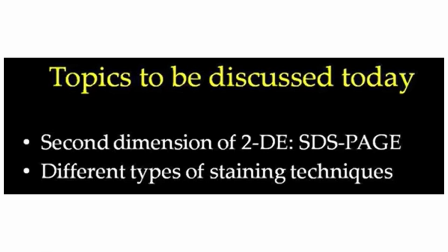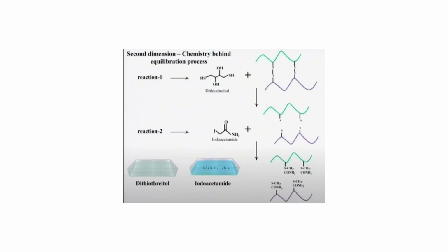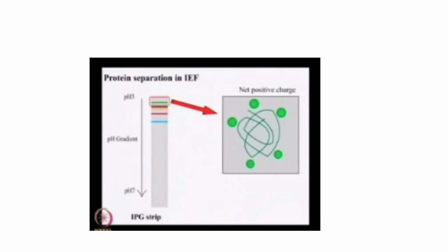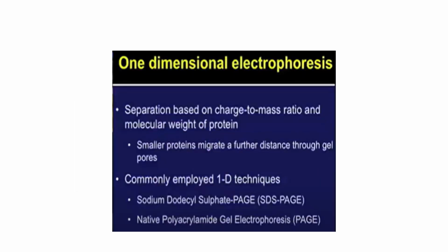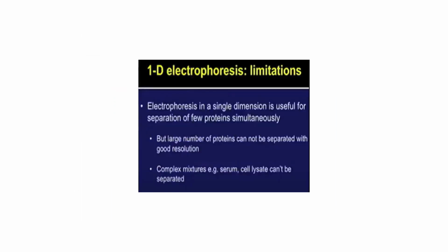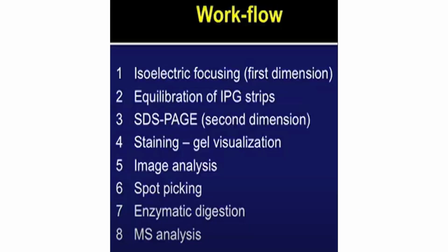So that's what is being discussed. So this was just an introduction to two-dimensional electrophoresis till the step of equilibration. So we just did the first dimension. We just did till equilibration.